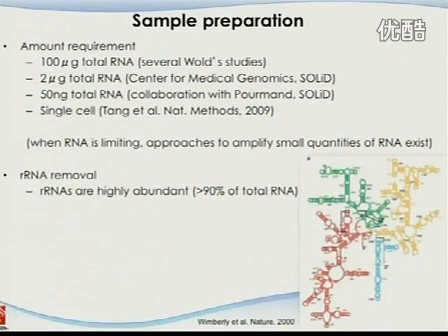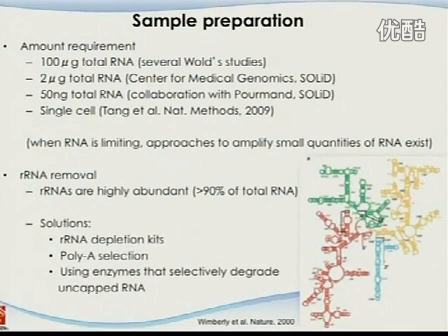Once those meaningful RNAs degrade, the only thing left there is ribosome RNA. That really costs us a lot of money and a lot of trouble to analyze the data. Right? But fortunately we got it through, and we convinced them that ribosome depletion is needed even for a small genome bacteria.